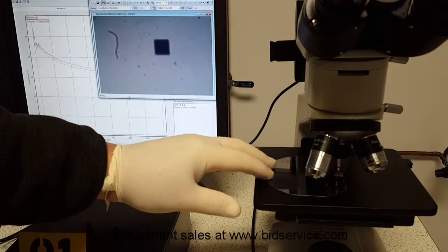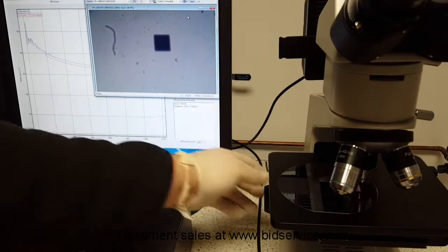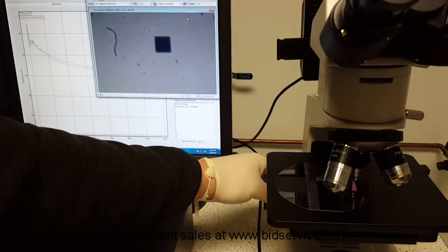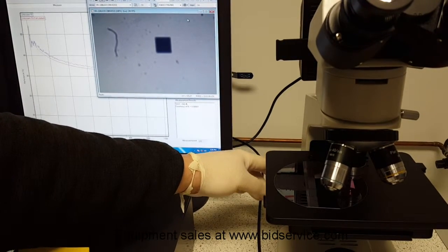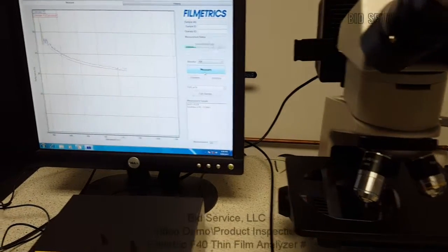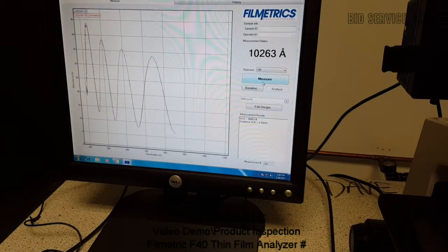Until we get right to that part. I'm going to focus it in. And there's a reading: 10,263.